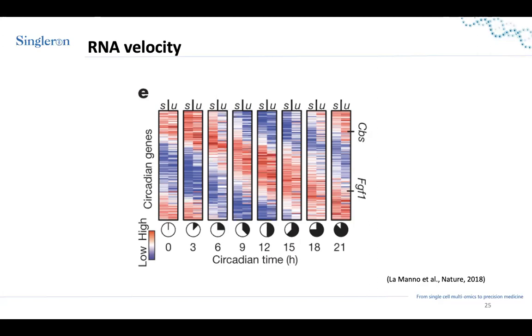So my question here is, how can we make sure that one single type of cells is introduced to a specific type of particular barcodes? Okay, so basically you need to optimize the concentration of your cell suspension, or the rate at which the cells are coming from one inlet. So you have cells entering from one inlet, and beads coming from another inlet. So you need to have the right concentration.